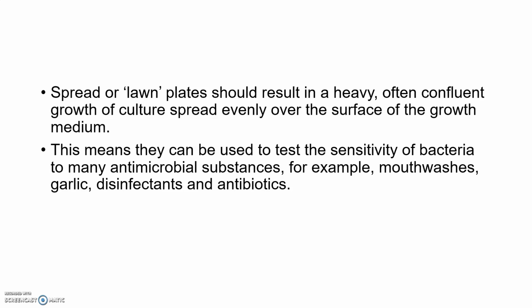So the spread or lawn culture plates may result in a heavy, often confluent growth of culture spread evenly over the surface of the growth media. This means that they can be used to test the sensitivity of bacteria to many antimicrobial substances, for example, mouthwash, garlic, disinfectants, and antibiotics.